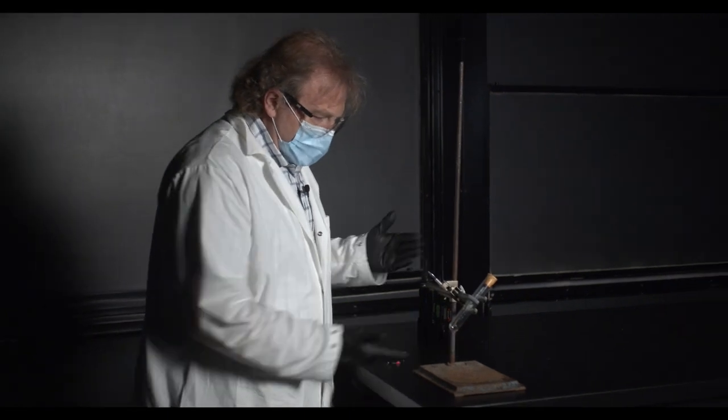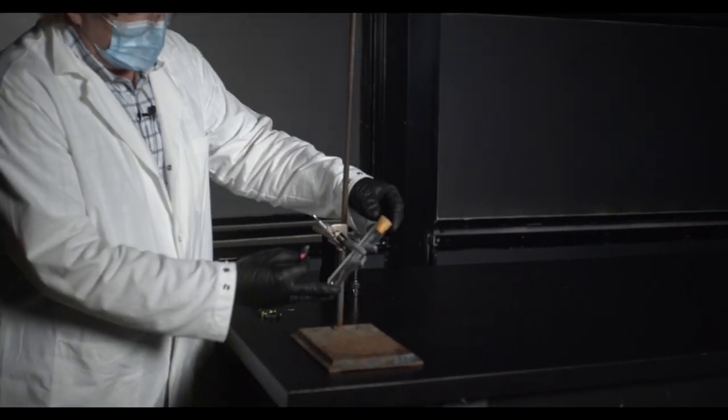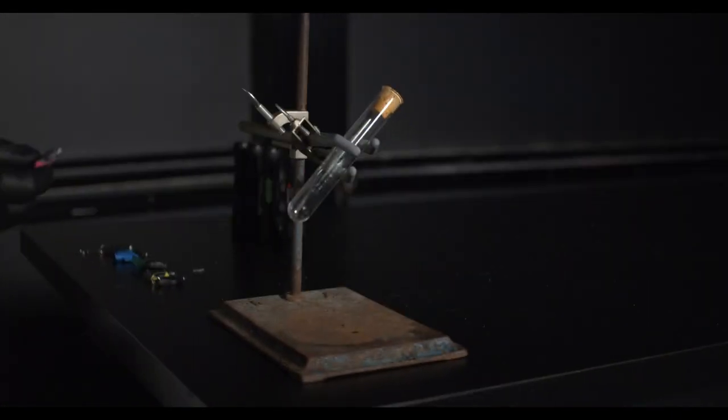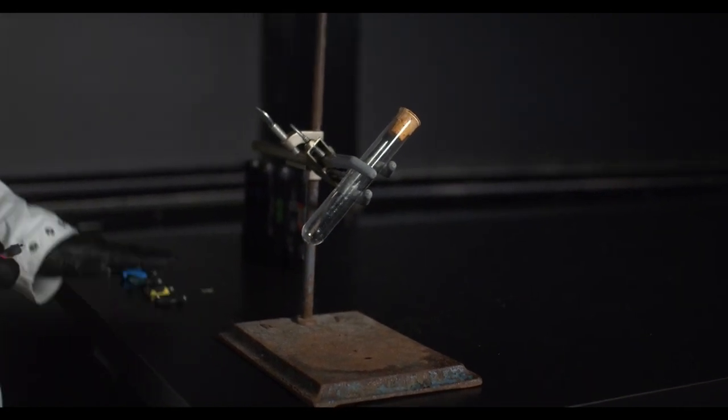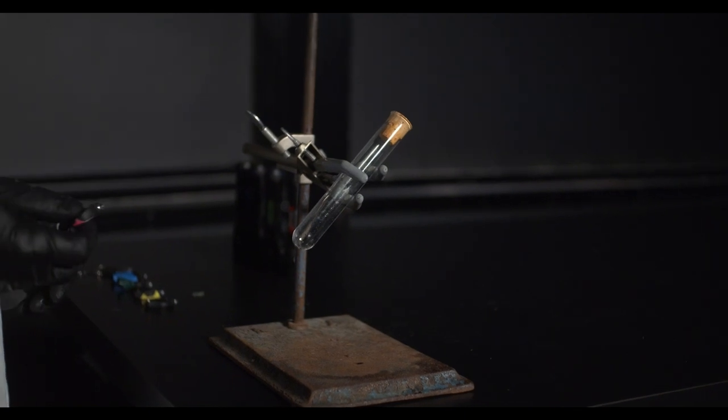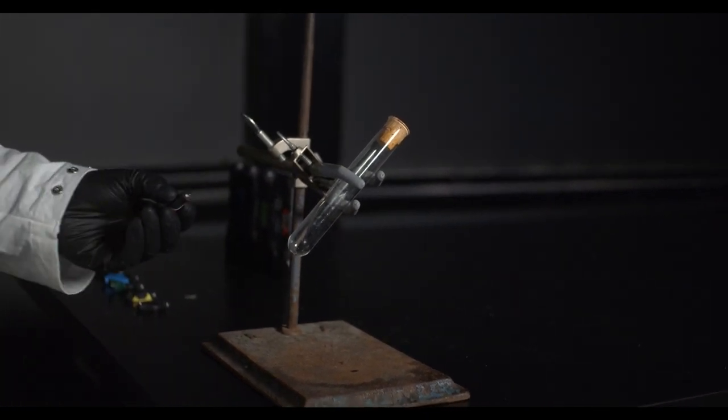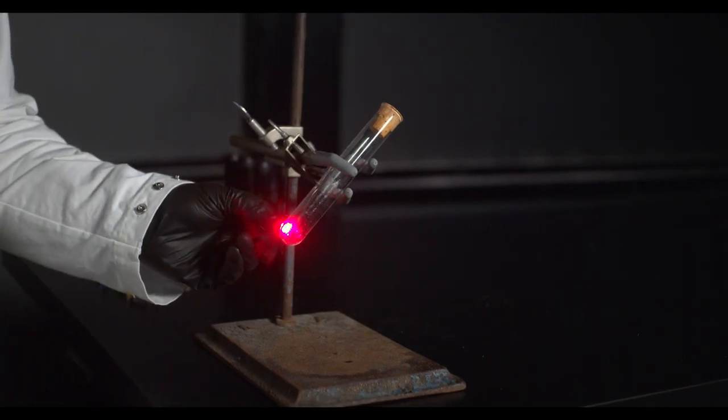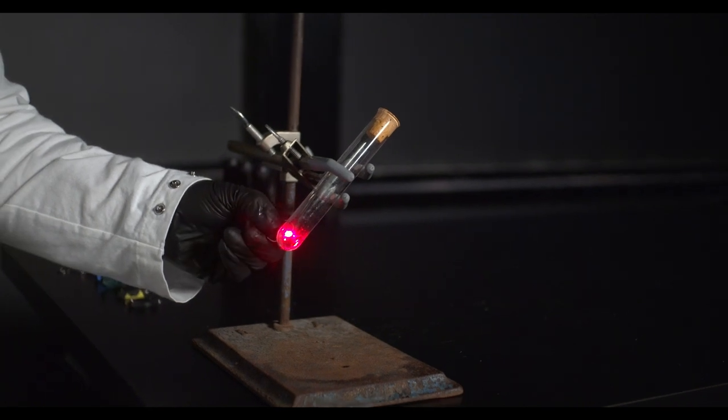Okay. Here we have a quartz test tube full of a stoichiometric mixture of hydrogen and chlorine, one to one. And we understand that hydrogen and chlorine is a reaction that can be set off with light. And so we're going to experiment with different frequencies of light to see what the threshold of reaction is.